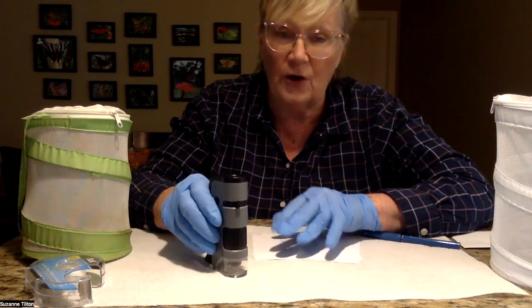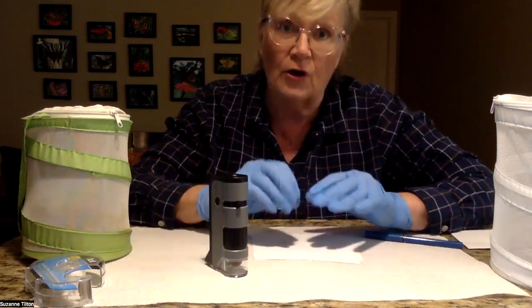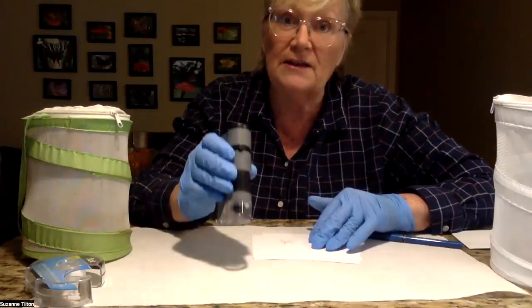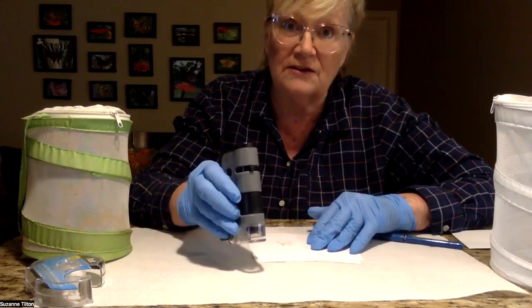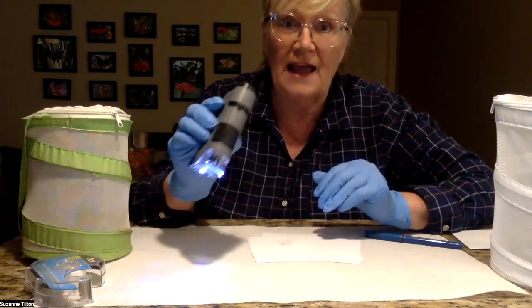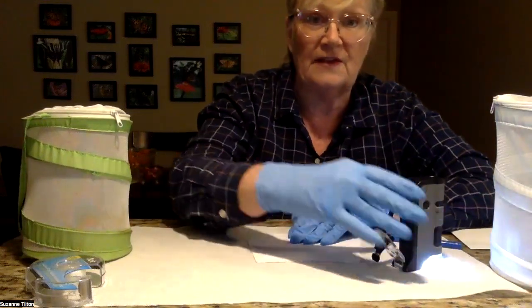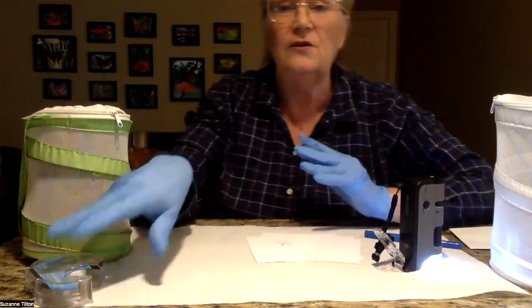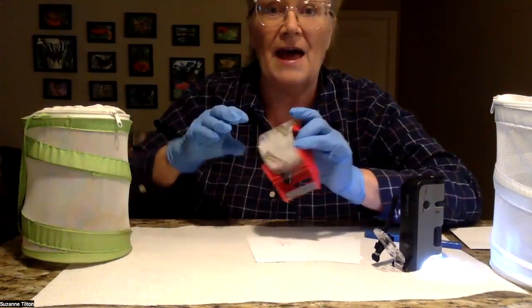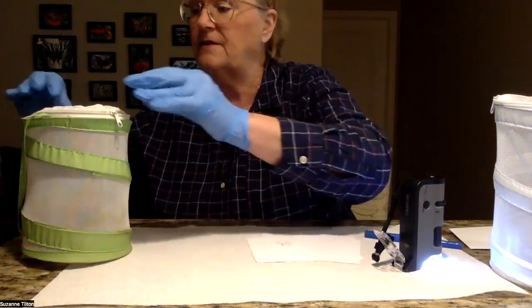You cannot see the OE spores with your naked eye. Even by looking at a Monarch or even a caterpillar, you can't always tell if they have OE. The only way you can tell is by looking at the scales of the butterfly with a microscope. I'm going to turn this on and have it ready — it has a little light on it. The other thing you need is tape, any kind of tape. I like to use packing tape because it's very clear and it's very strong. I already have my tape over here ready to go.